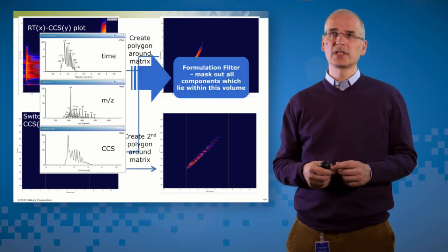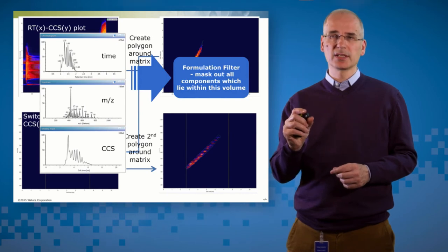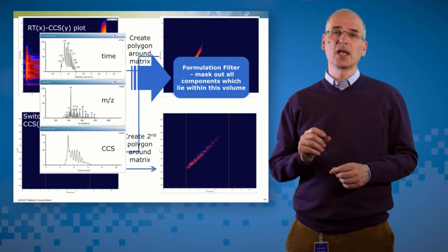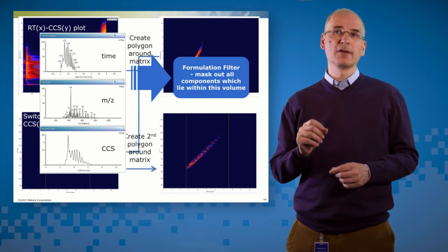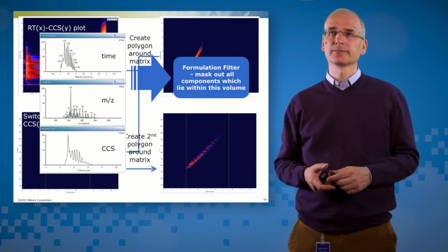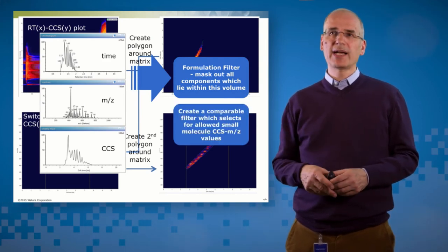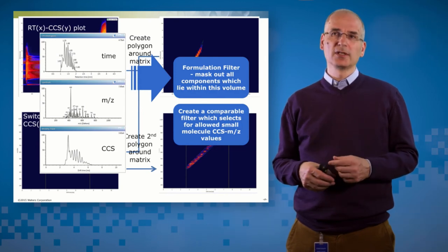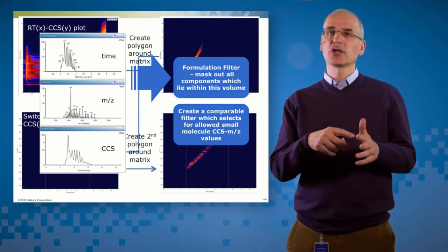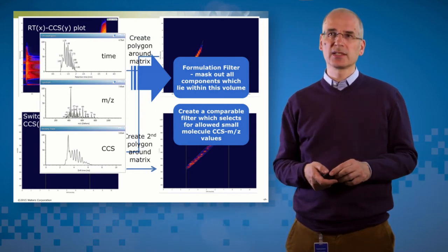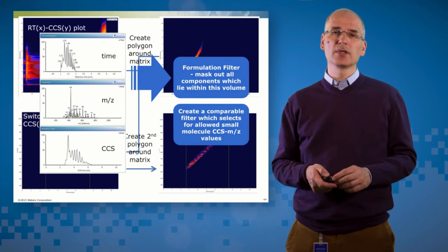And having done that, I can create a formulation filter. So this is something that's going to lie inside my processing method. And I can say, if a detected component lies inside that volume, flag it as potentially belonging to matrix. So one that I perhaps don't have to consider. And I could create a comparable filter, which selects positively for small molecule mass over charge retention time CCS space. And I can include that filter in my data processing.